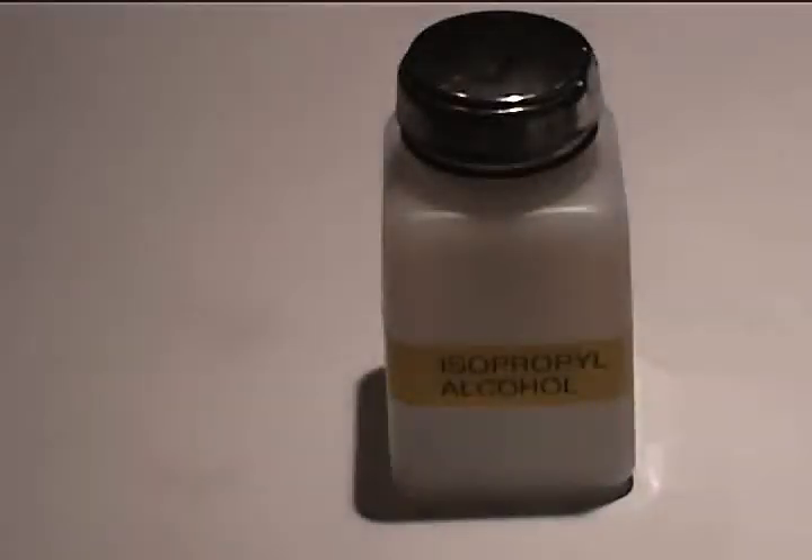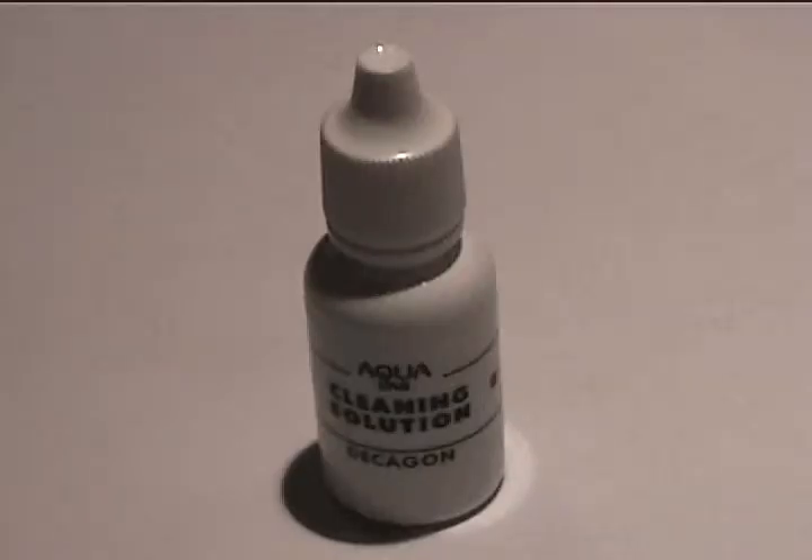Cleaning your Aqualab CX2 block is a simple procedure and should only take about 10 minutes. You will need isopropyl alcohol, Decagon's cleaning solution or distilled water, and chem wipes and cleaning rods.